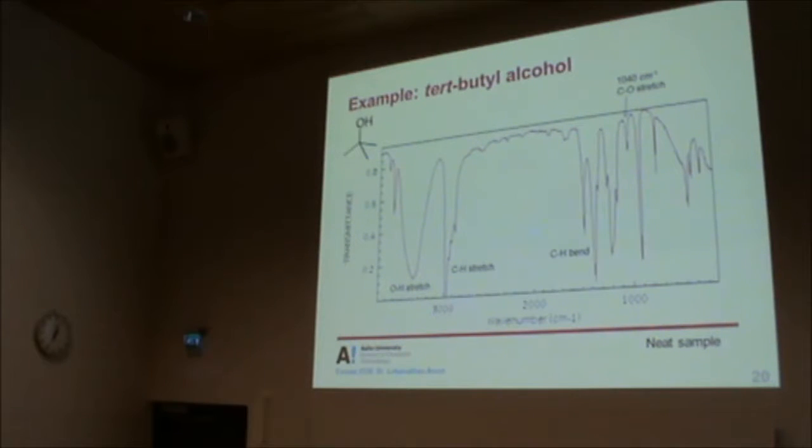So now, you see the CH stretch is pretty narrow, but then OH has become very wide. If this sample had a little bit of water in it, this whole region will be one peak. So you will lose this information. Now we have the OH stretch, CH stretch, and CH bend. And you also have the CO stretch. So now we have added one hydroxyl to this group.